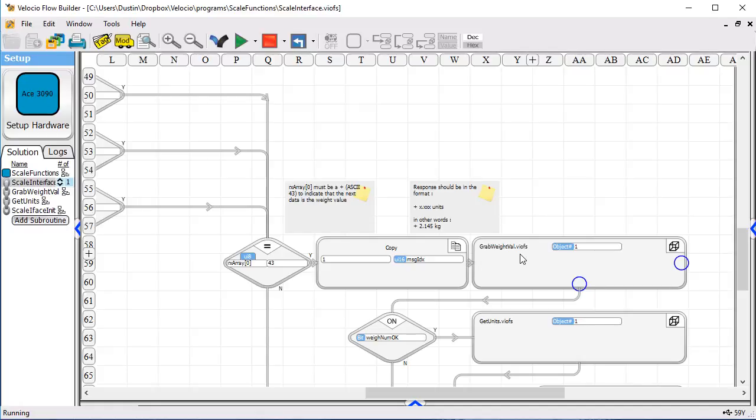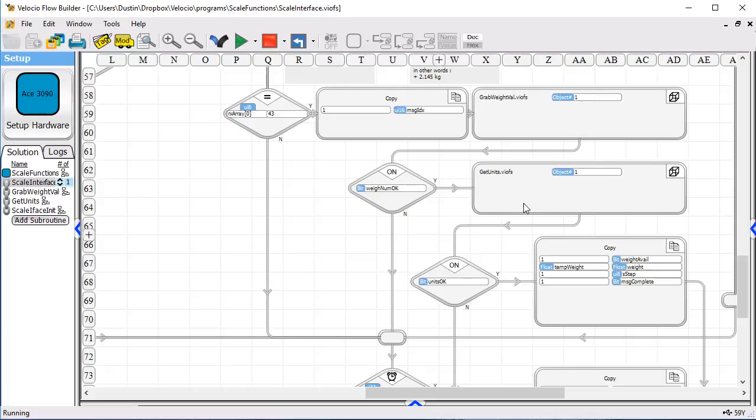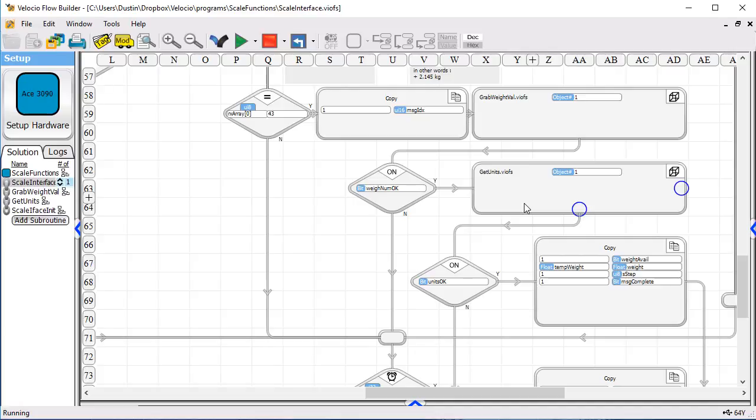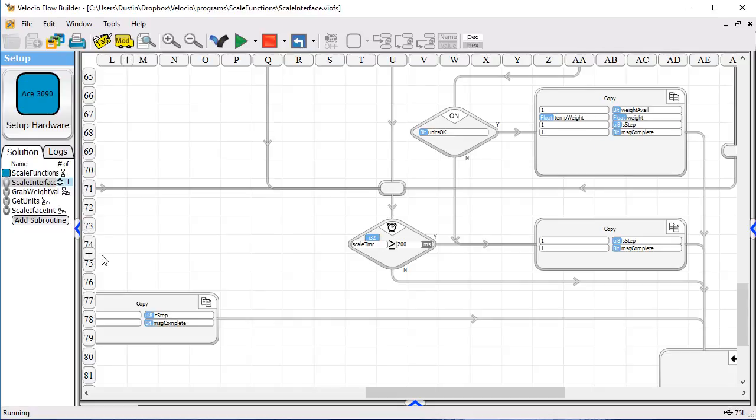And then, if that checks out, we have a similar subroutine that goes back out and checks to see what are the units. Units could be, in this case, either kilograms or pounds. And if that's all okay, we write that data back out so it's available to the main program.